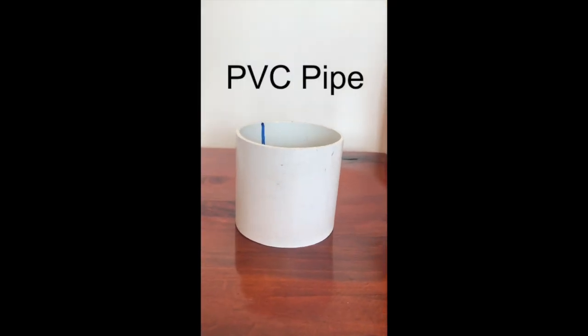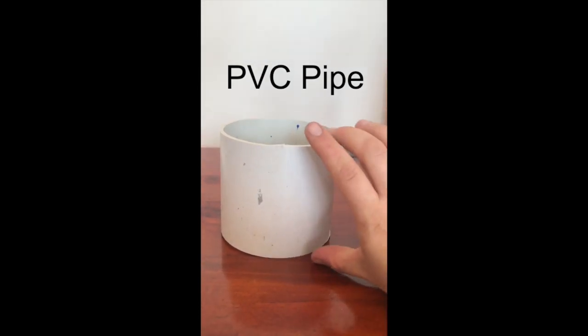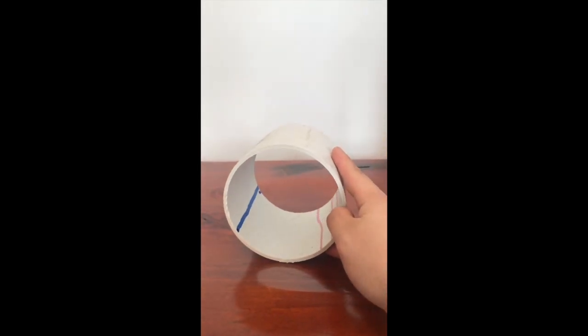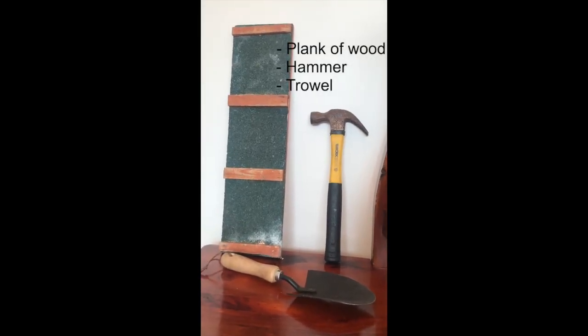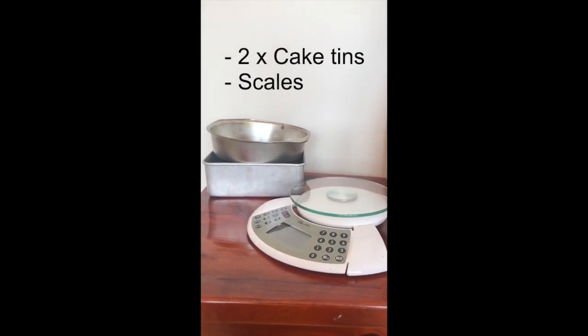First up, you're going to need a piece of PVC piping. Here you can see we have a cutting that is 100 millimeters high. The diameter matches the height, also 100 millimeters. Next up, you will need a plank of wood, a hammer and a trowel. Lastly, you will need 2 cake tins and a set of scales.